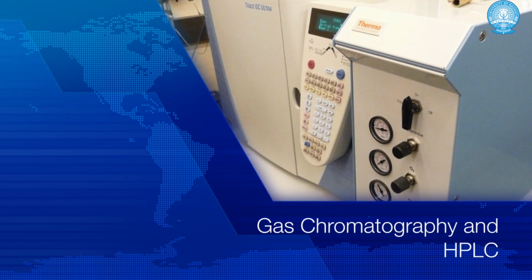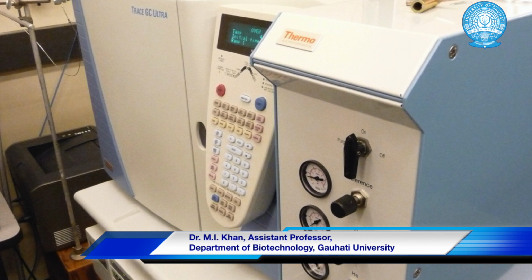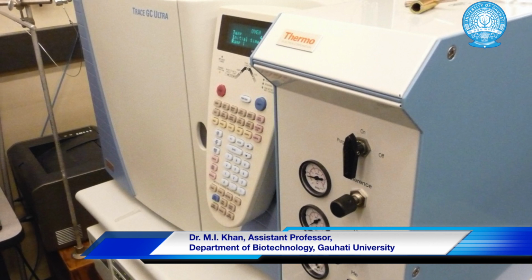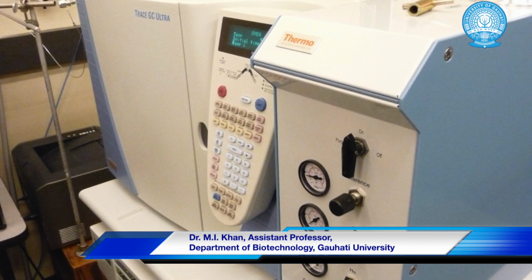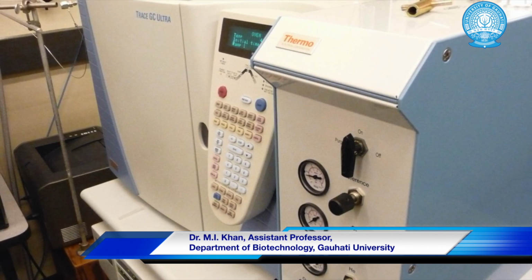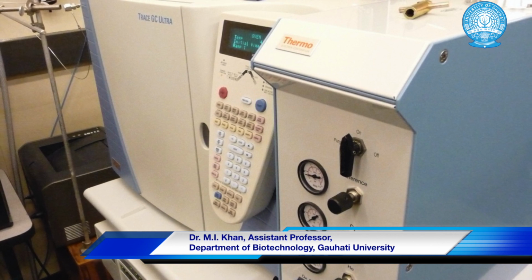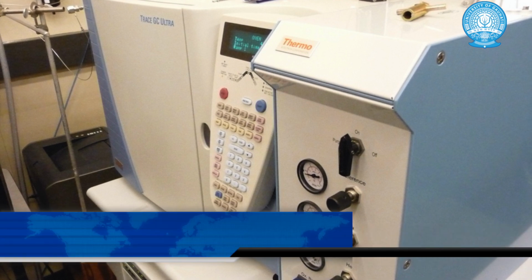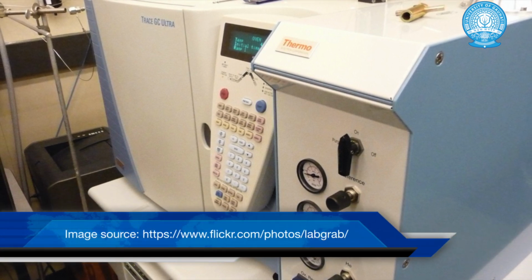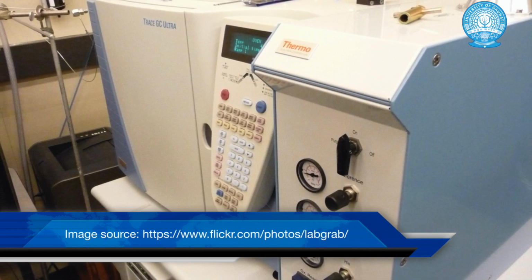Dear students, today we will talk about gas chromatography. It is a technique used for separation of volatile compounds, and it can also be used for the separation of non-volatile compounds after derivatization. However, only volatile compounds are preferred, and slightly non-volatile compounds can be used after derivatization.